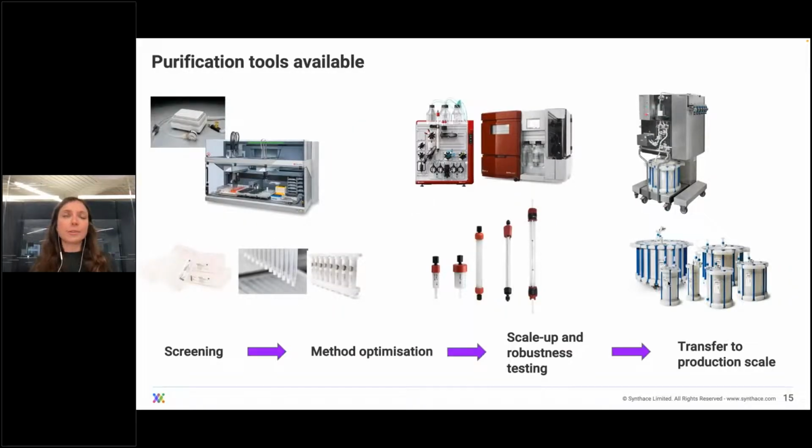So in downstream development, there's a number of key high throughput development tools available, shown here on the left-hand side. And what's great about them is that they are highly amenable to the use of DOE, given the fact that they provide this option of testing many different factor level combinations at the same time for a fraction of the cost of these higher scale DAP models over here that you see here. Therefore, what this means is they are a great starting point for gathering relevant information about factors, so which factors actually matter, and the factor levels before moving towards these more expensive scale-up runs.